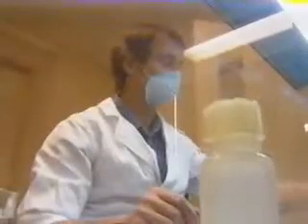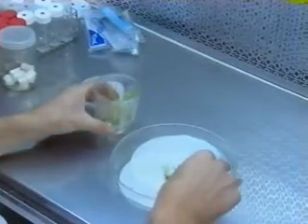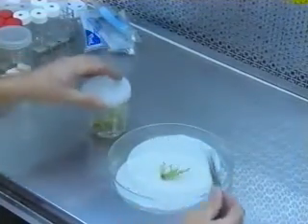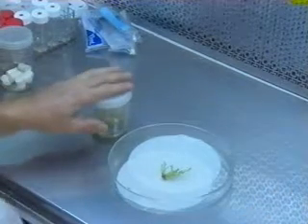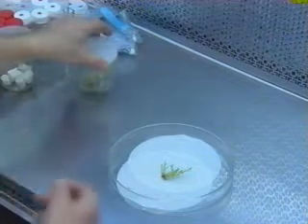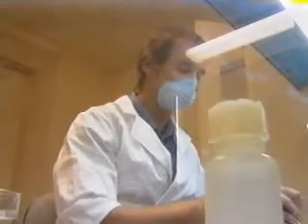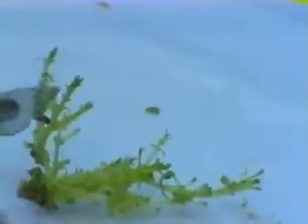The third method is to include an elongation phase here by placing the propagules into a medium without cytokinin or at very low levels of cytokinin for 2 to 3 weeks, and in some cases adding gibberellic acid. This may be necessary when numerous short shoots result from the multiplication stage.